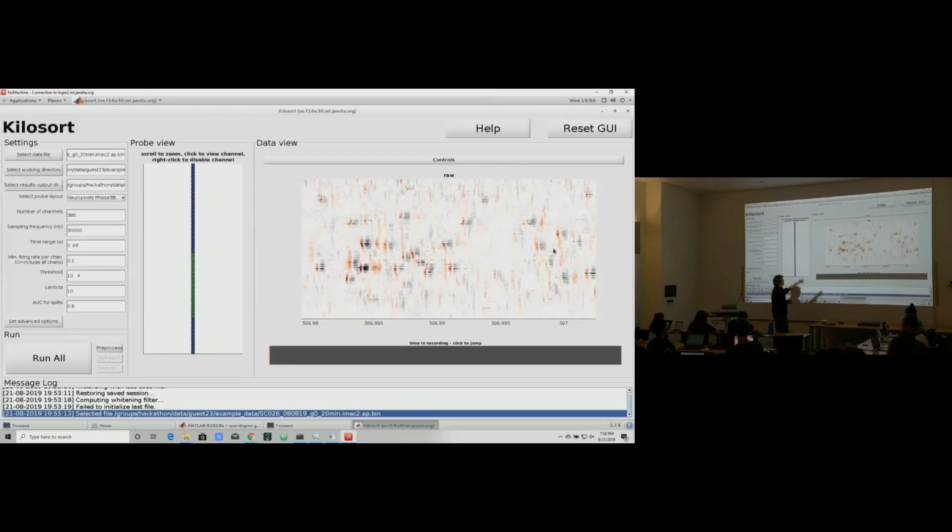So all of these are going down and back up. What I like to think is they look like little fish in an aquarium or something, right? They're like clownfish. They're red and blue. So that's how you parse them apart, by just parsing the little fish. Anyway, so we can see the spikes.